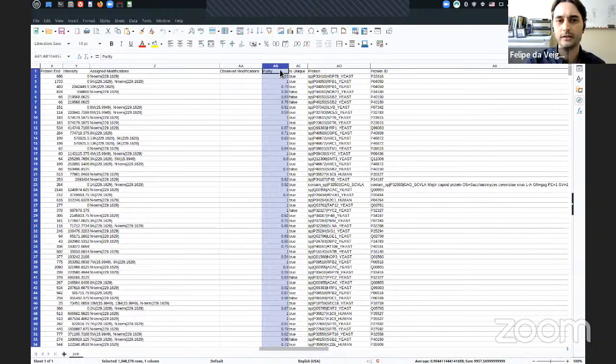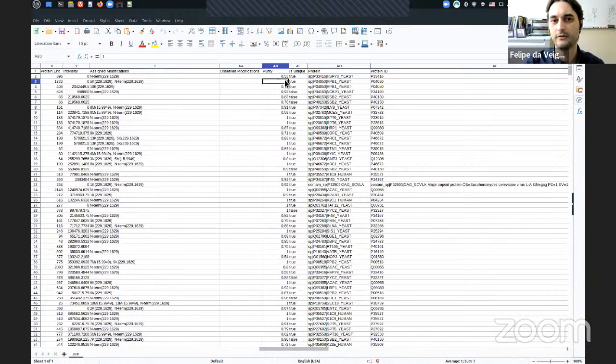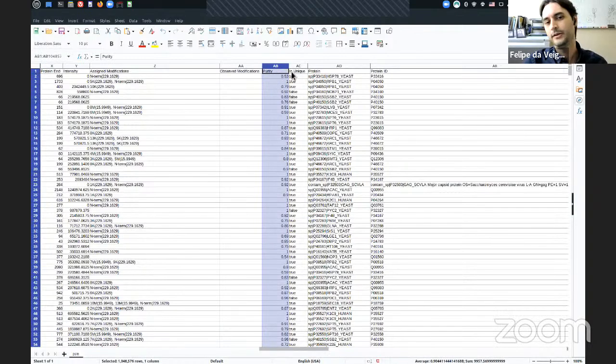We look at the precursor spectra to see how much interference we have from other peaks. It goes from 0 to 1, 1 being 100% pure, meaning that there is no co-isolation or anything else. This is one of the things that TMT-Integrator uses. I believe that the standard threshold is 0.5, so everything with a purity of 0.5 or higher is used. The other ones are discarded.